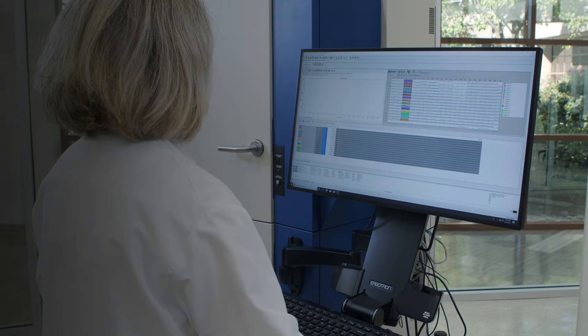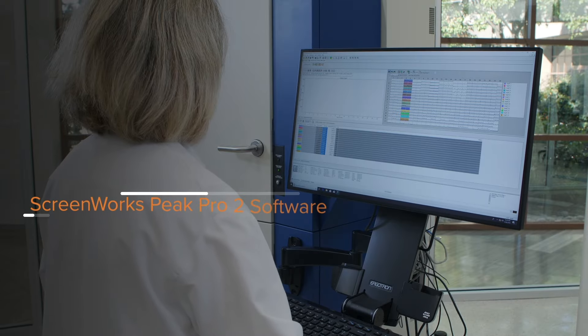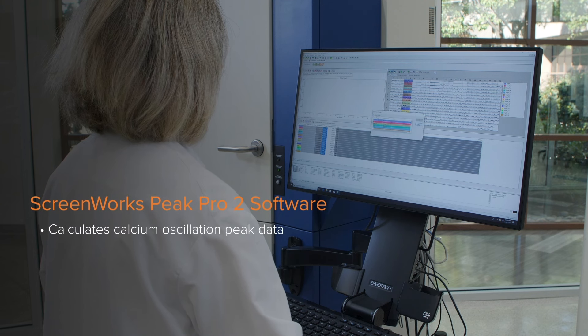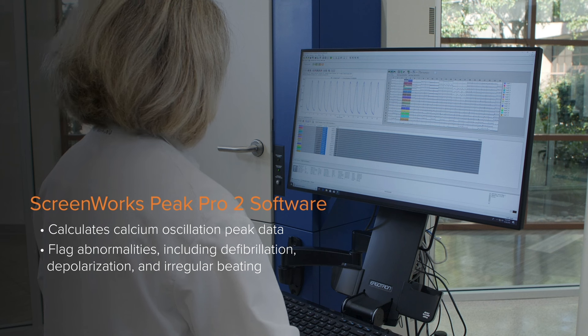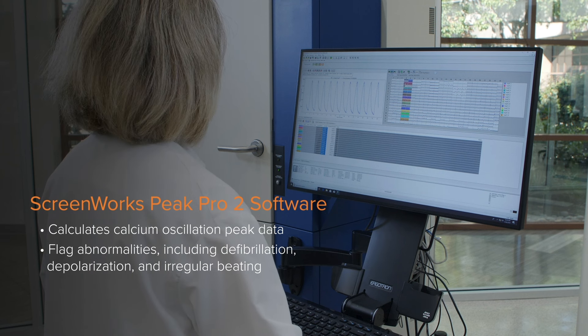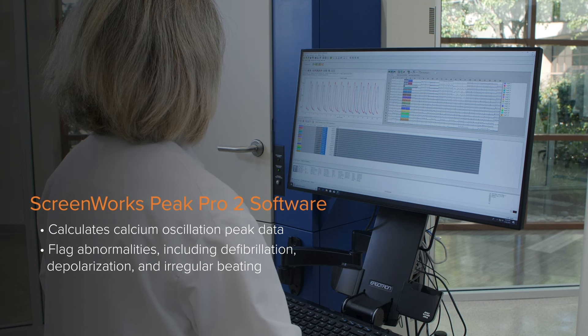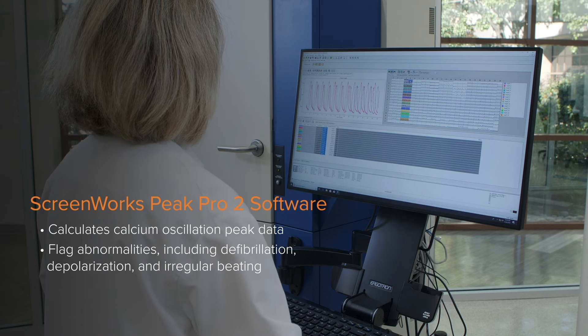The newly released, updated ScreenWorks Peak Pro 2 software calculates calcium oscillation peak data and can quickly flag abnormalities including defibrillation, depolarization, and irregular beating.